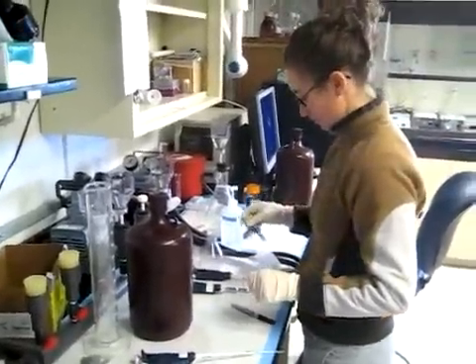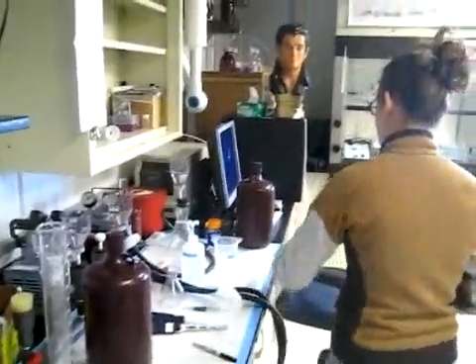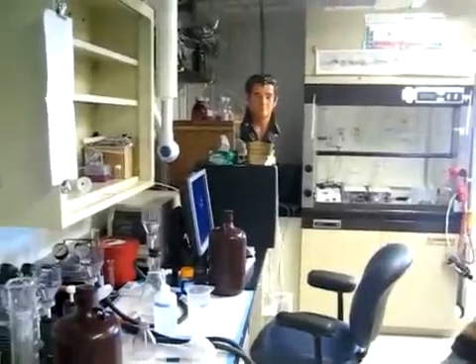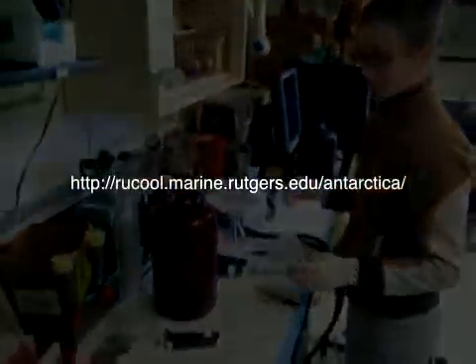Each of these brown bottles are the ones that were collected from the various depths when we were on the zodiac earlier today. And that's Elvis in the background — the origin of man who doesn't care about the water.